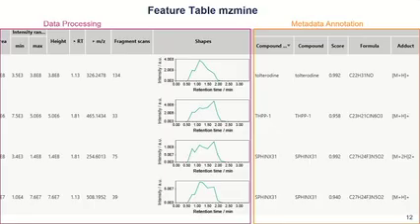And this is then the feature table that you get in MZmine. So we have here the data processing, what you did today. And this is the annotation. It's basically kind of similar to the spectral library matching that you did today. But in this case, we only check if we have the m/z, and if we can explain it with something that should be included in the sample, with different adducts that you can also enable in MZmine. So you start in your compound table with the exact mass, and in MZmine you can say which adducts you want to include, and then based on the calculation and based on the file that should contain those 10 compounds in our case, you can search if there's any mass matching to your set compounds and adducts.